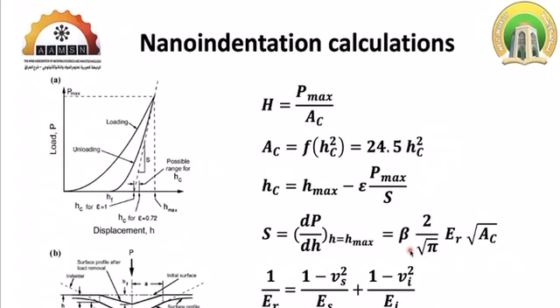If the audience has an idea about Hertzian contact theory: when two different materials come into contact, for example diamond contacting metal, the two materials have different moduli. When we push them together, we have what is called the reduced modulus, which comes from the moduli of the two materials, which might be hugely different.